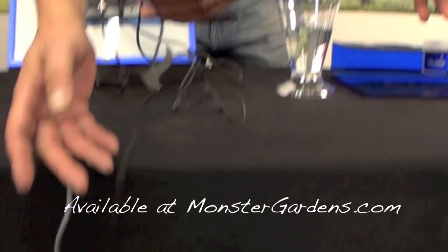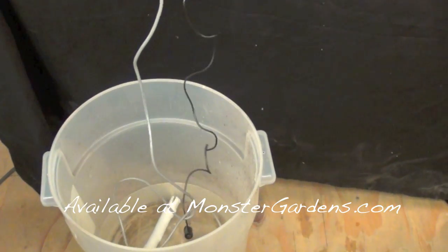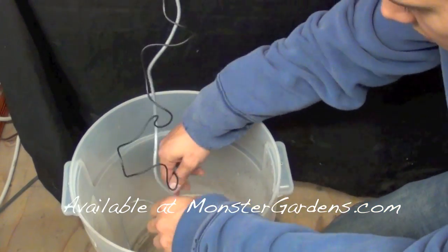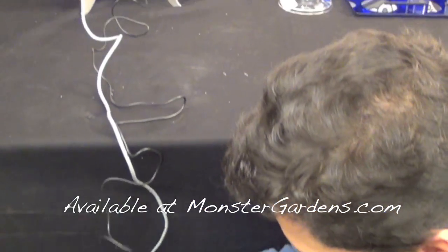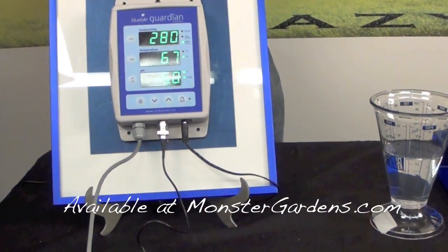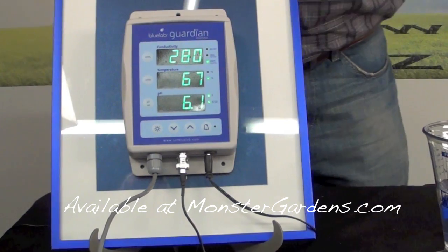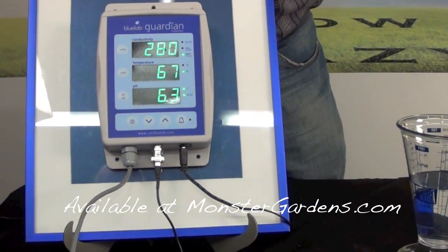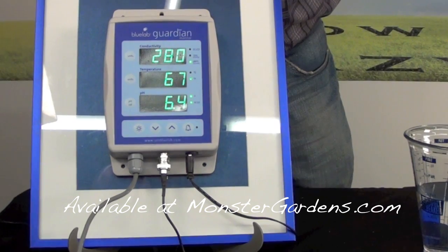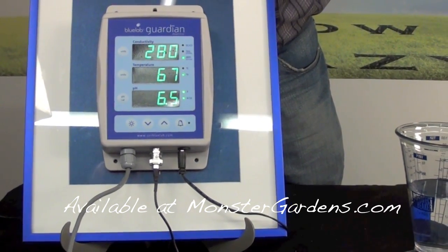We have a solution here with both probes — our conductivity probe and our pH probe — and it's settling in and getting a reading. It should stabilize. It looks like on the top we have an option for EC, CF, TDS, and PPM. Right now we're showing the PPM.